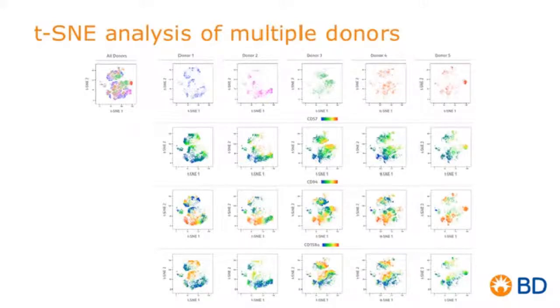Donor 5, if you look, for example, at CD94, you can see that right at the right of the plot of donor 5, there's a very unique population. It seems to be unique to that donor. It's very highly expressed in CD94, and there are similar different patterns if you look at CD158A. However, this is more of a spatial distribution. It's not really going to the single-cell level.